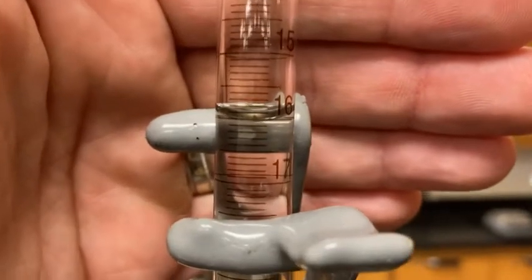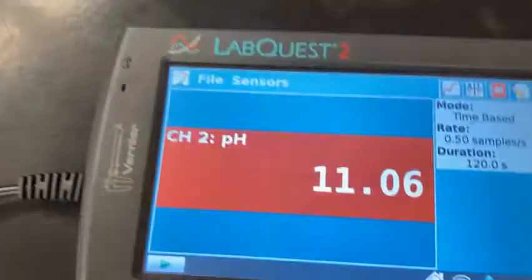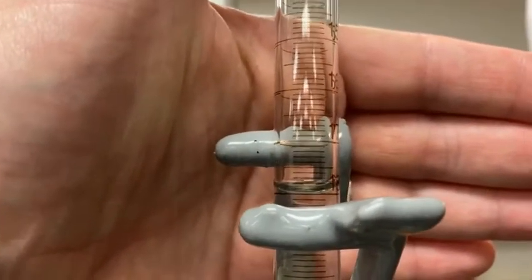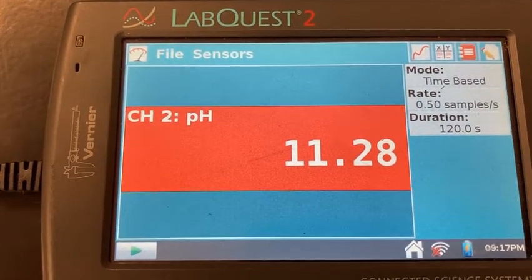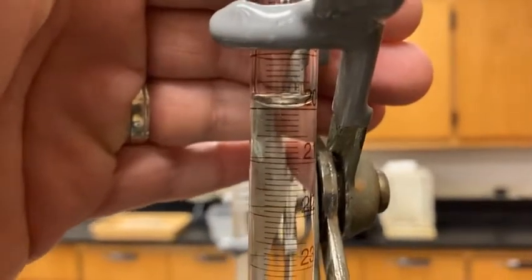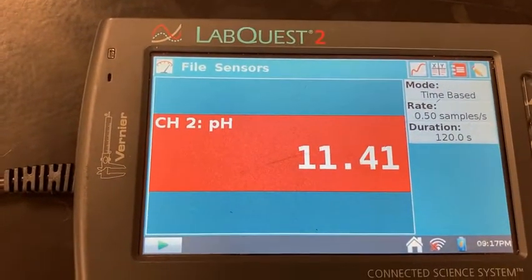Next addition is right there. Here's our pH. Maybe add 2 more after this. Meniscus is kind of between the lines here. I think you guys can read that okay. And our pH, as a result, is right there. Much more steady now. This will be our last reading. Got it right to the 20. And the pH, because it's staying pretty steady now, we'll end it there.